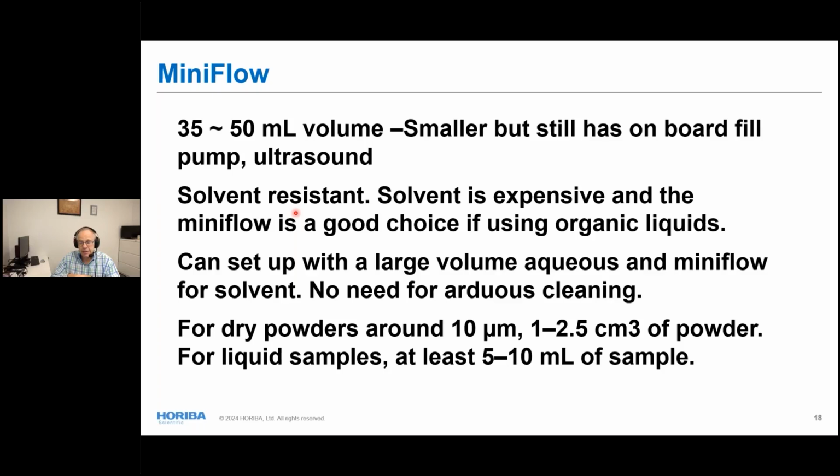The second is that if you're swapping between aqueous and non-aqueous use, so if you're running water versus cyclohexane, for example, you would need to rinse the system with an intermediate solvent like alcohol or THF or something like that. And so switching between organic and aqueous, it takes a bit of time.